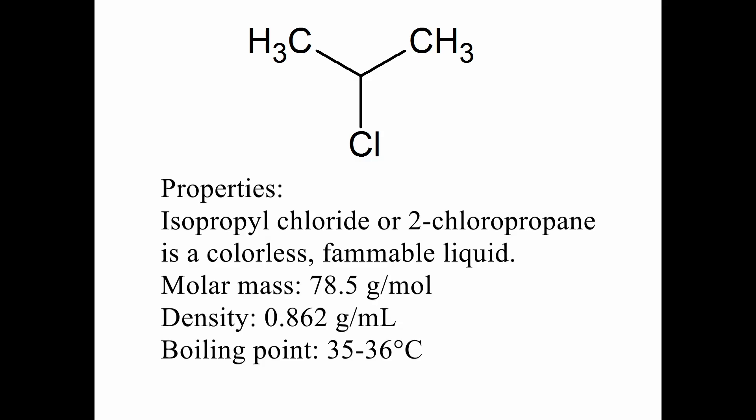Isopropyl chloride, or 2-chloropropane, is a secondary haloalkane. I will be making some because it can be used as an alkylating agent and I want to make an organic compound containing an isopropoxy group.